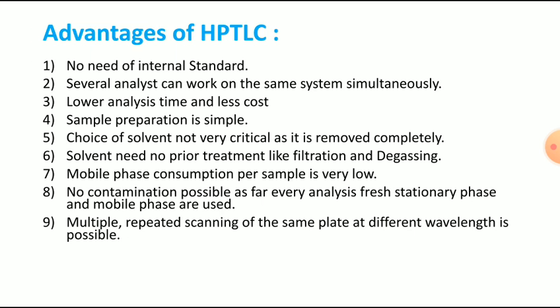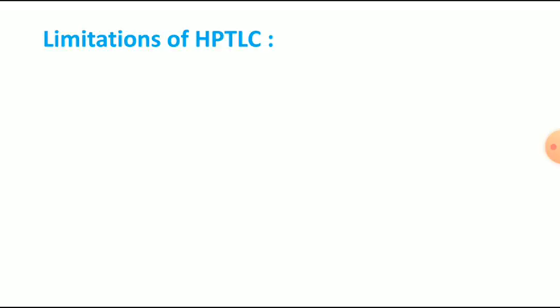Now we will see the limitations of HPTLC. First limitation will be that it cannot be fully automated. See, some parts of this HPTLC we can do manually also, so it is not fully automated.